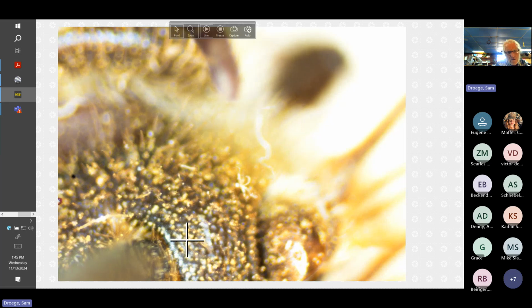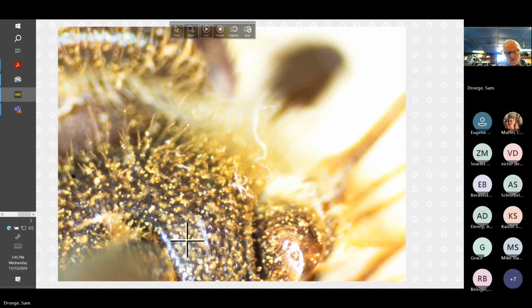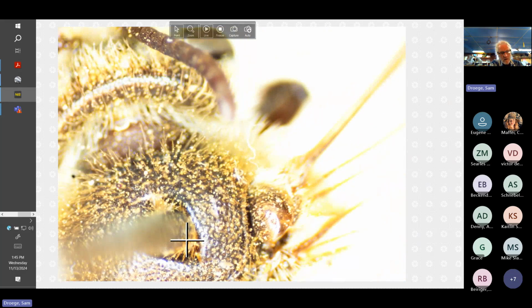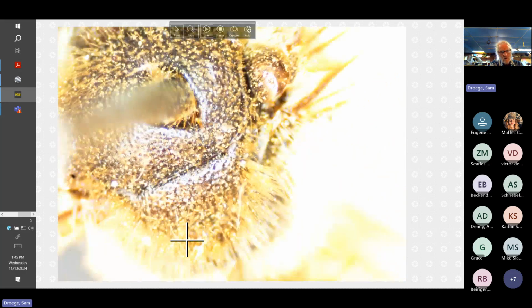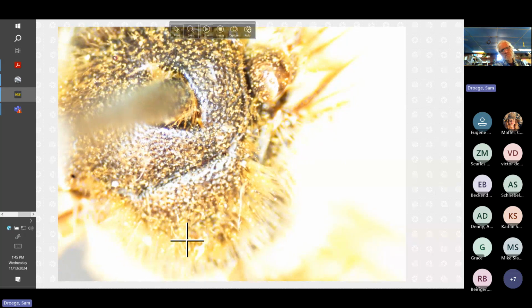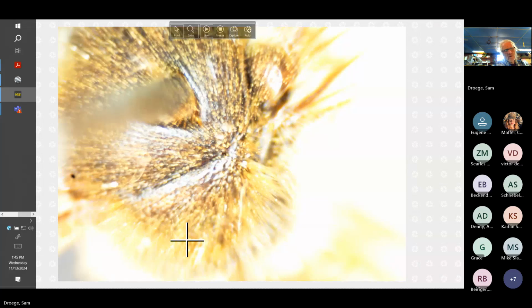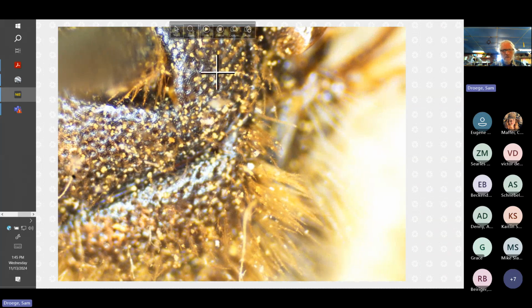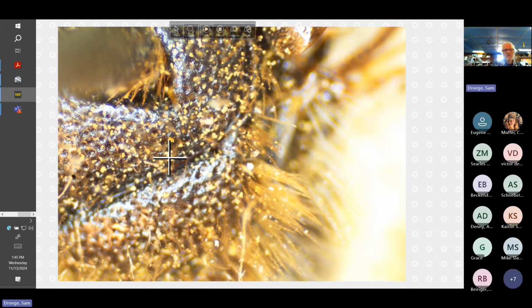It's not like we have isolated pits that I can see, but I'm not thoroughly convinced that maybe it's always zero. Let's take a look down here. But it's pretty darn close. So we can look throughout these areas and we see most of the time it's touching. So whether it's 100% or not, it's a little hard to tell.